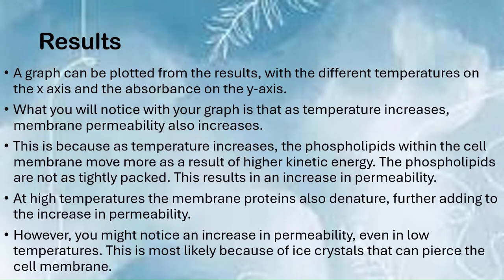So, looking at the results, a graph can be plotted from the results with the different temperatures on the x-axis and the absorbance on the y-axis. What you will notice with your graph is that as the temperature increases, the membrane permeability also increases.